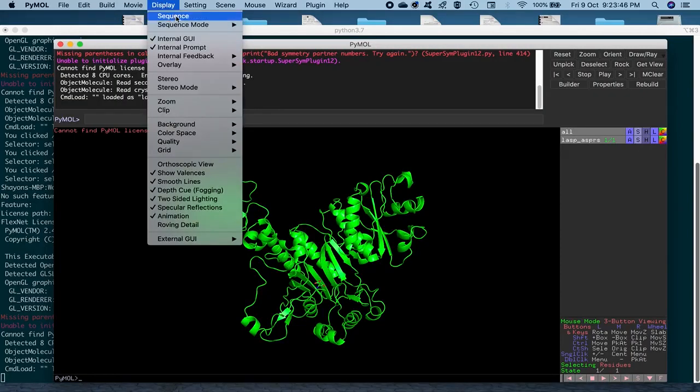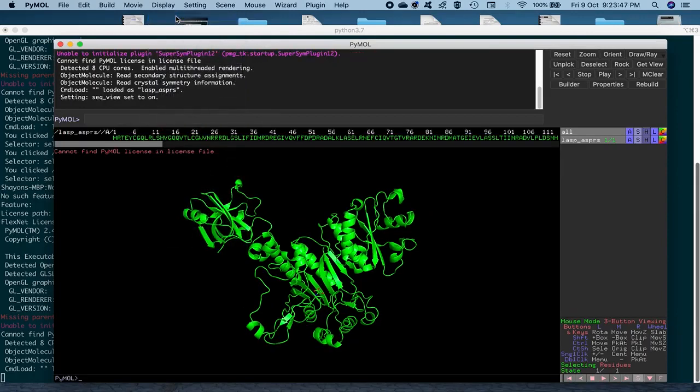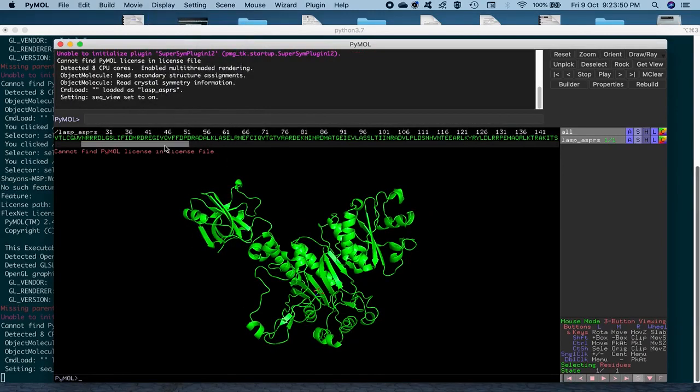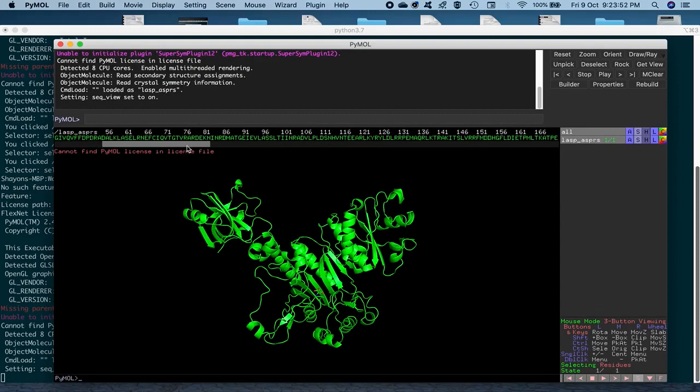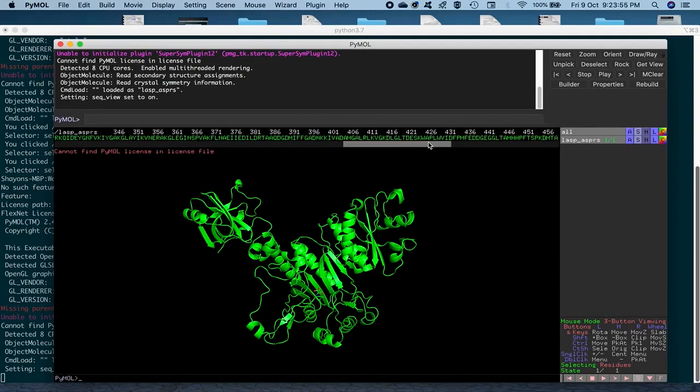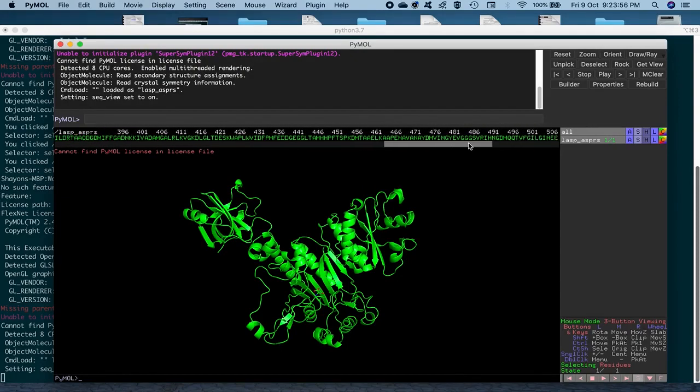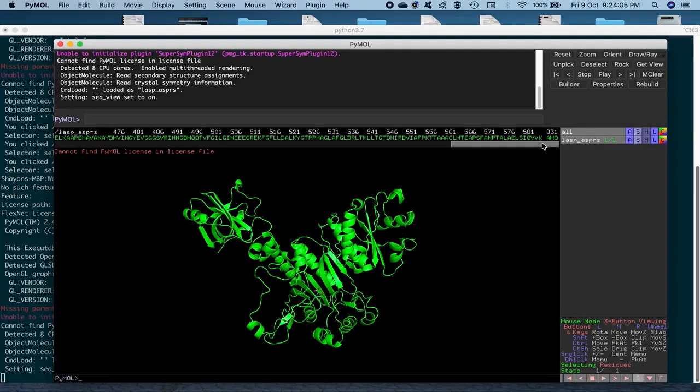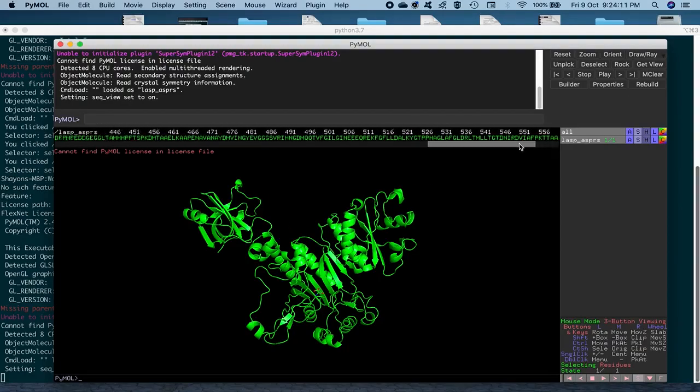So we go to display and display the sequence and we see that the one letter code of the amino acids and the protein is displayed out here. They are all chain A and then towards the end, you have this AMO that's displayed in the three letter code because it's a non-standard residue and it doesn't really have a one letter code. It's not recognized as a protein residue.